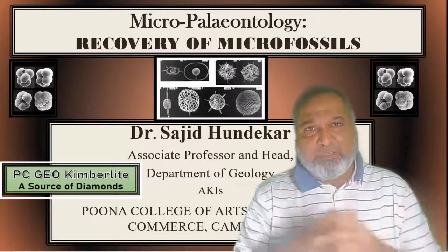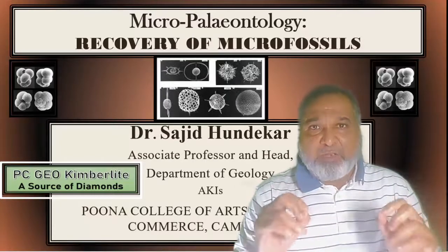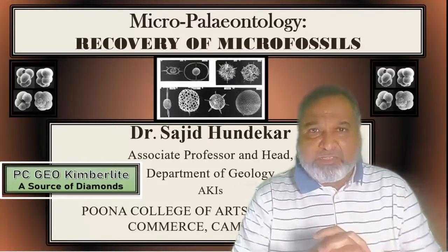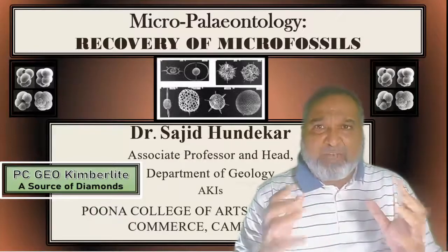Today we are going to see an important topic from micropaleontology: how to recover the microfossils. So, recovery of microfossils from the matrix.